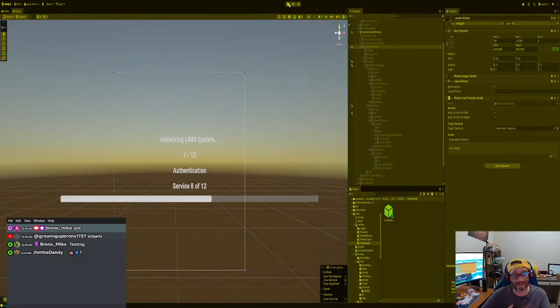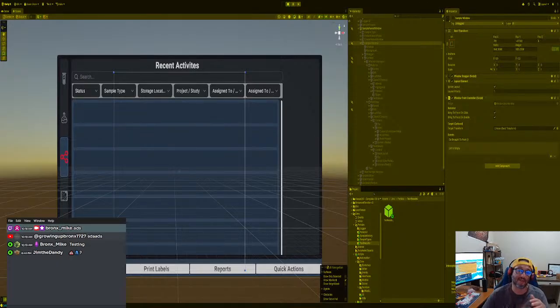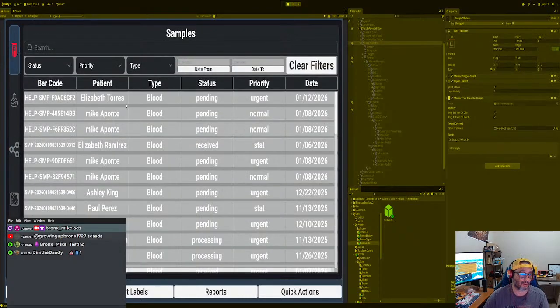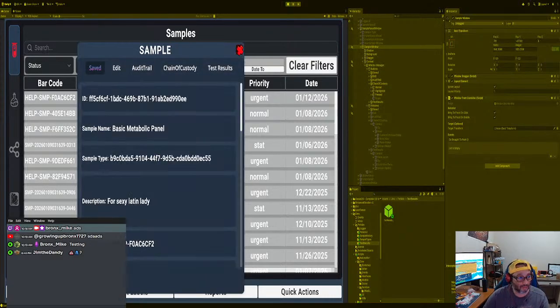But it's a good idea to double check everything, and it's a good way of learning. Like if you're a great front end developer, but you're not a great SQL script writer, that's a good way to learn. You ask the AI to do something for you, and then you look at the code and it gives you a lot of sample code, pretty much.